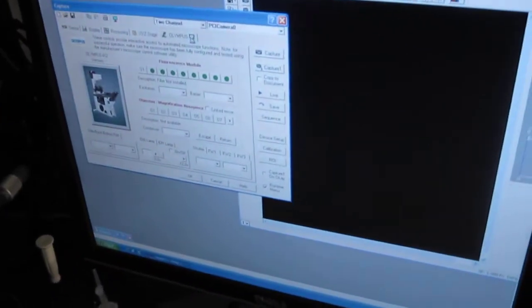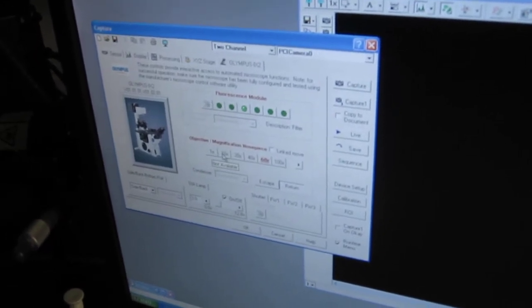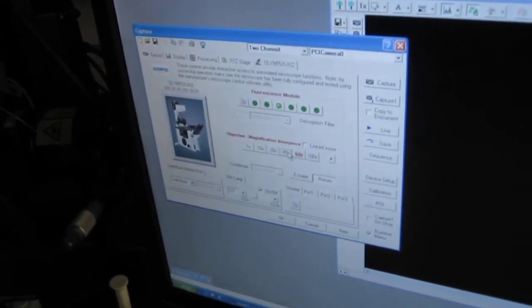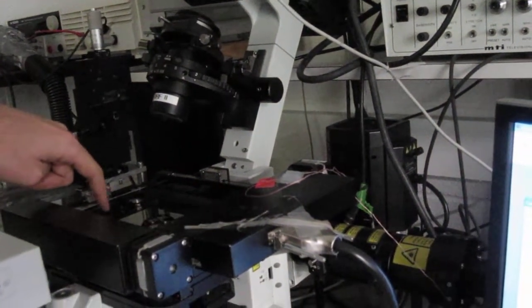And in order to select the different objectives, we're going to go here to this Olympus tab, click it, then this dialog comes up, which we just cancel, and then we have access to the motorized stage that controls the objective position. Now, the values for the objectives here don't really match the ones that are here. You just have to change them until you see the objective that you want in the right position. Even if here it says 10x, that's not necessarily what comes up here. You have to check.